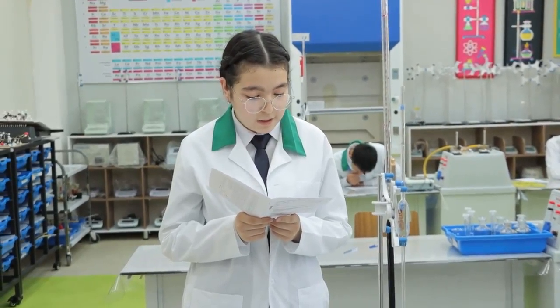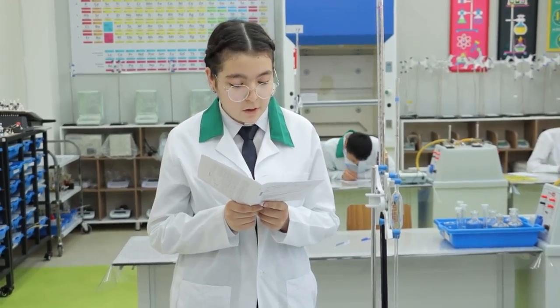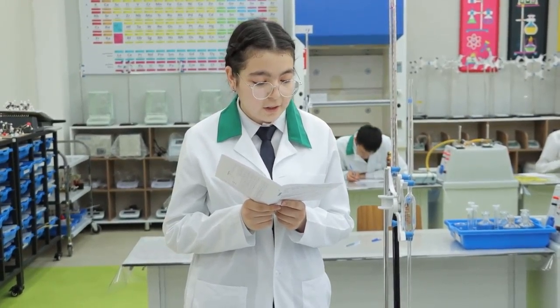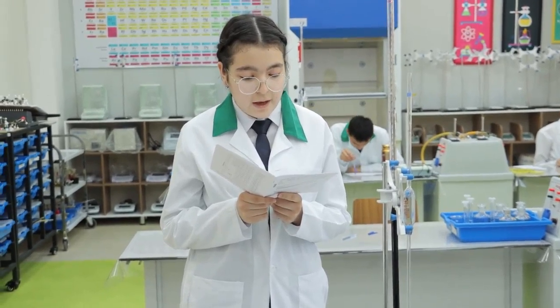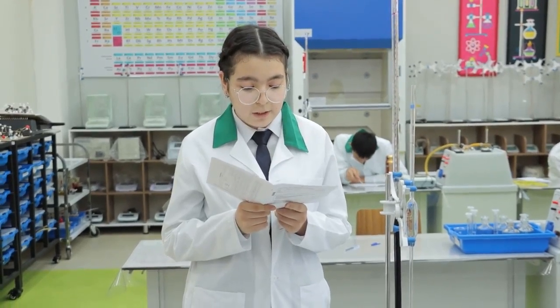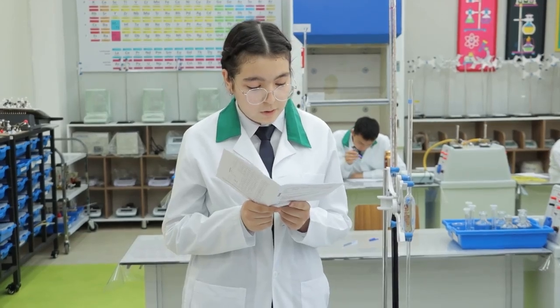In the first test, it was nitric acid, because in the question it's written that it doesn't contain any carbon or sulfur compounds, so we tested for it, and we added first silver nitrate, and there was no change, and then we added sodium hydroxide, and a gas is given off, which turns damp litmus paper blue, and it was ammonia, and then we added KMnO4. It changes color to purple, so it's going to be nitric acid.